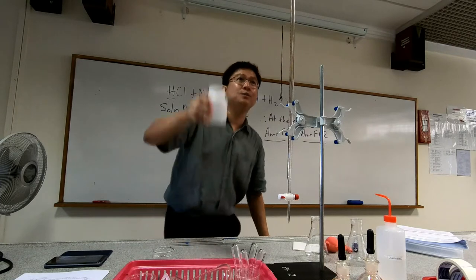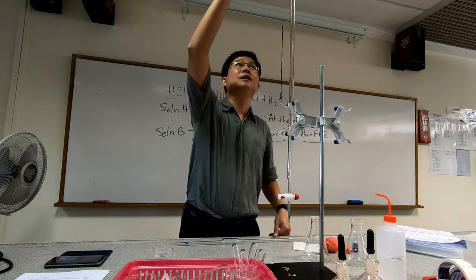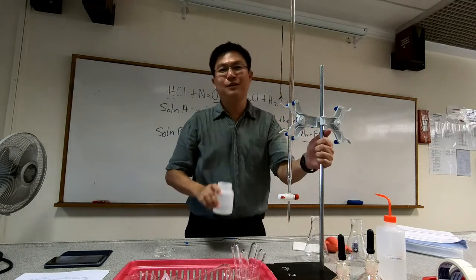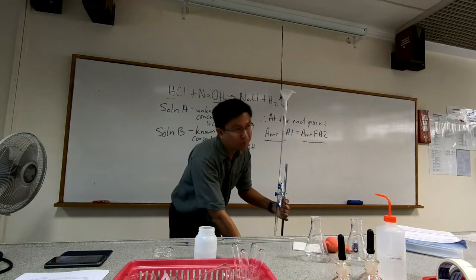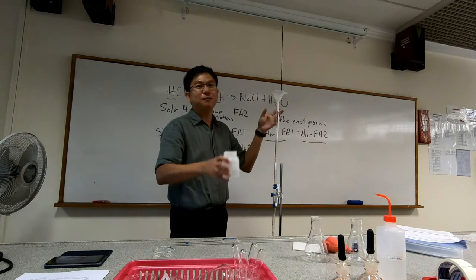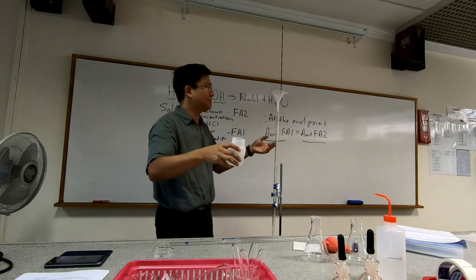Do I do it this way? No, because this is a safety concern. If some of it were to spill on my head, that would not be very good. Therefore, I'll put it slightly lower down, so that now it's below my head, and preferably below my eye, because we do not wish to have it in our eyes.